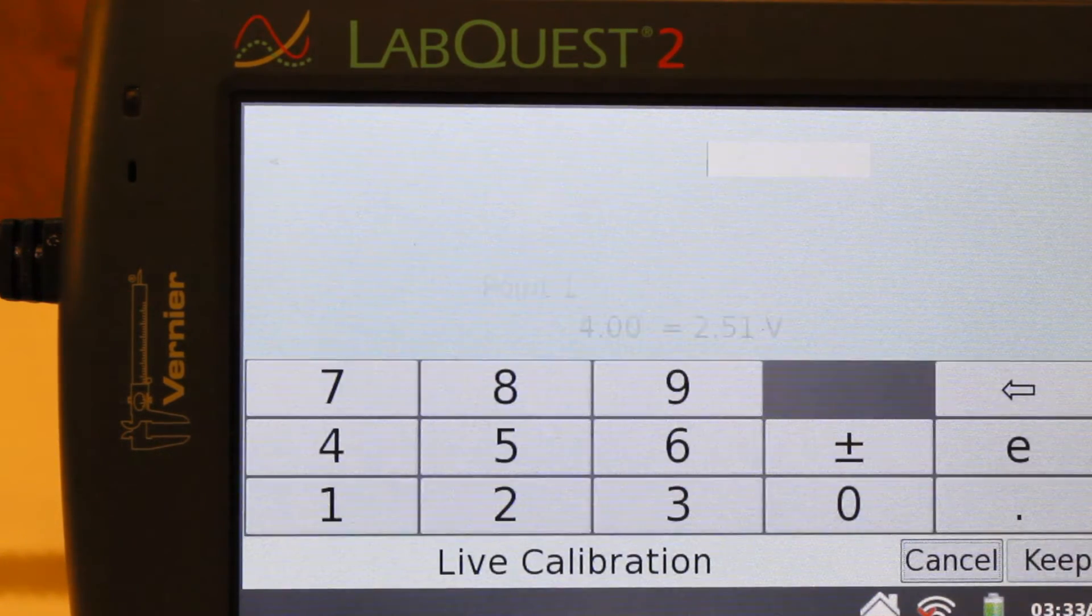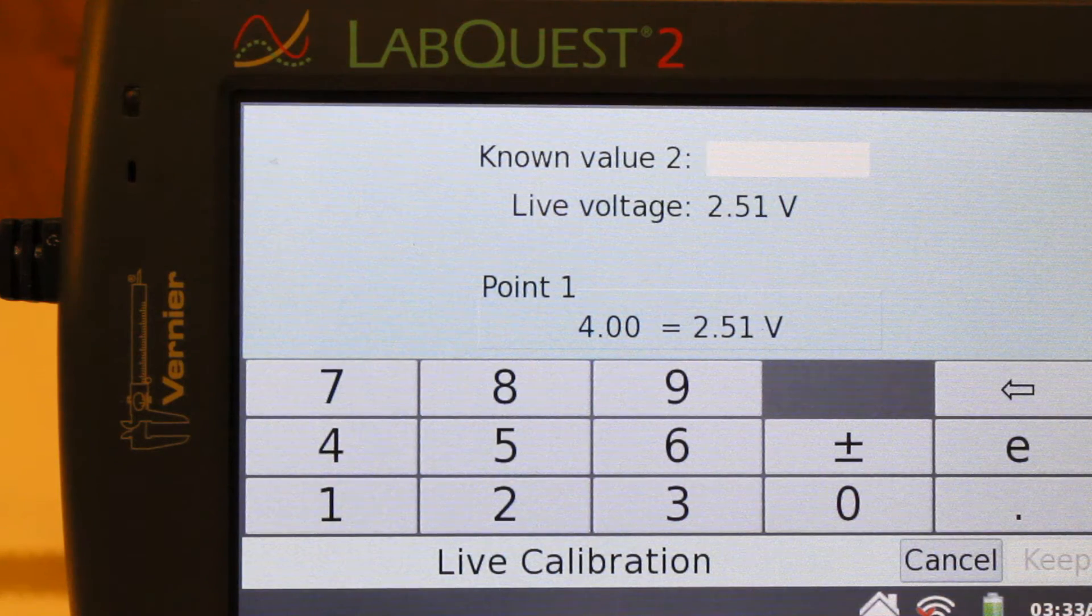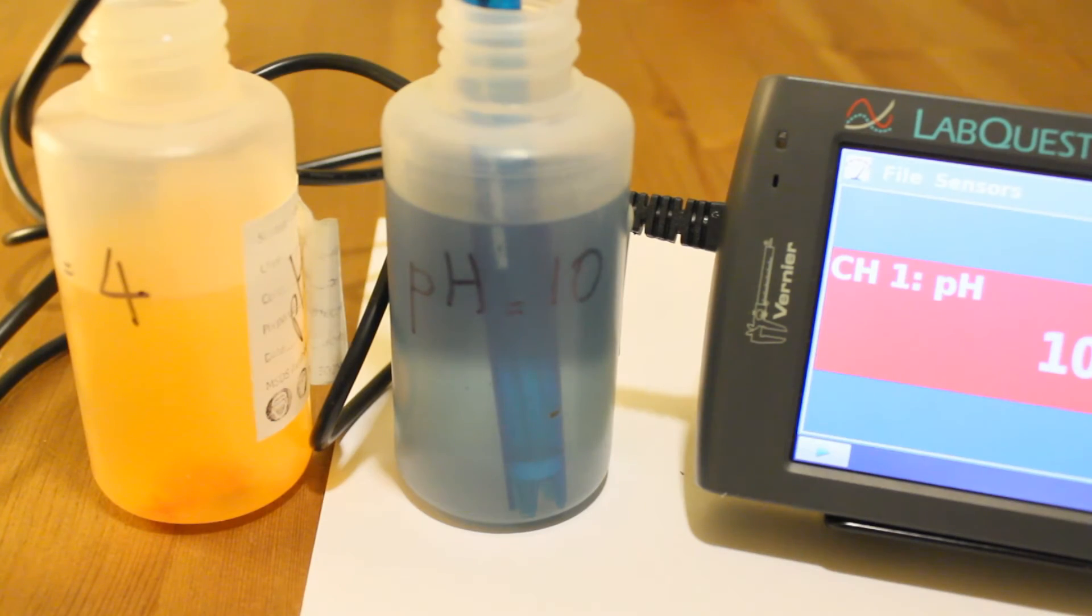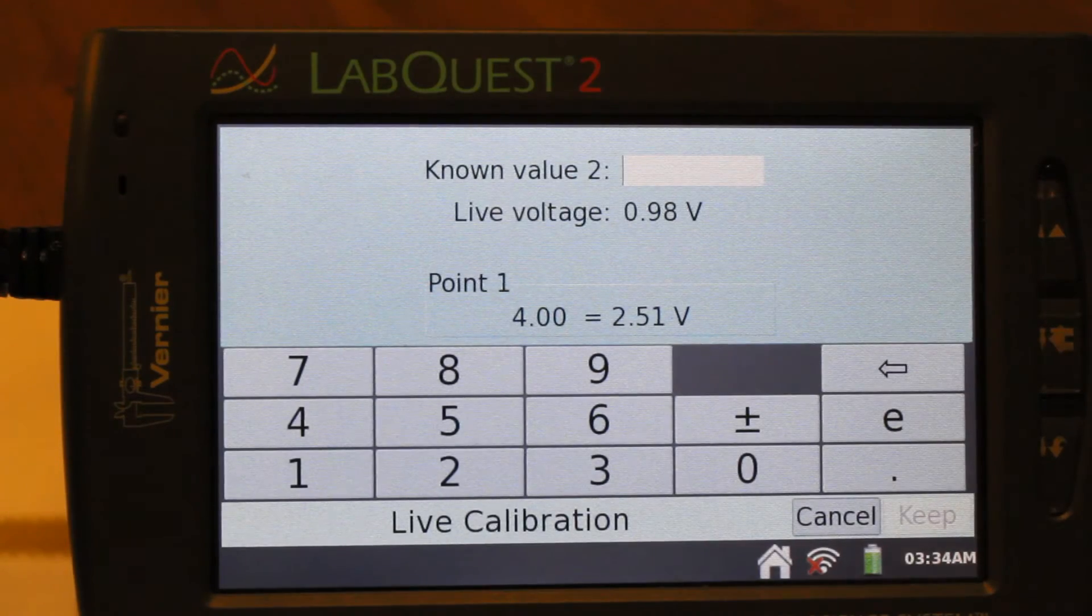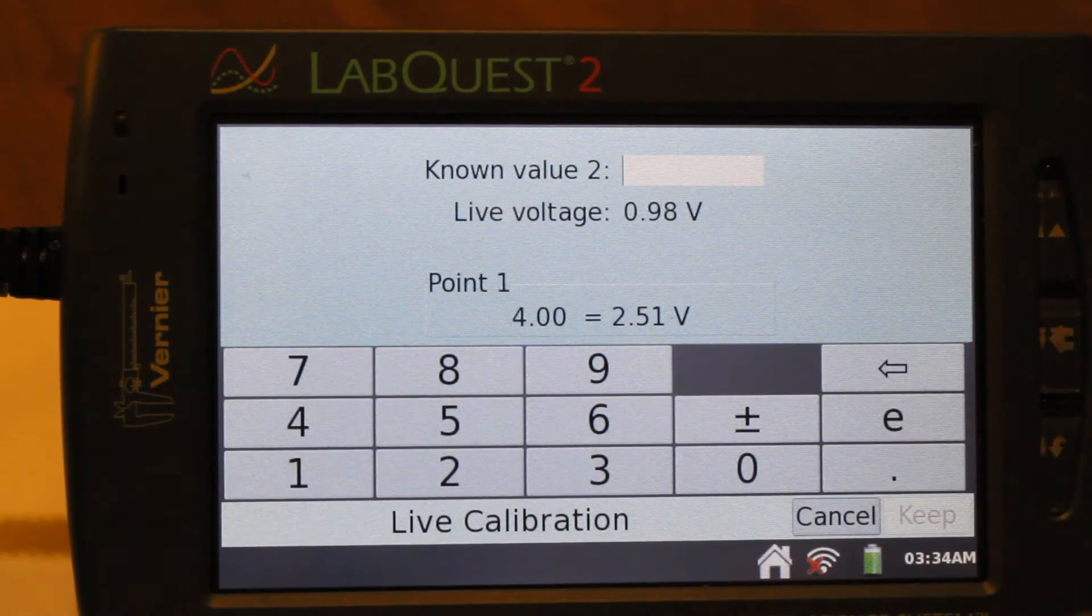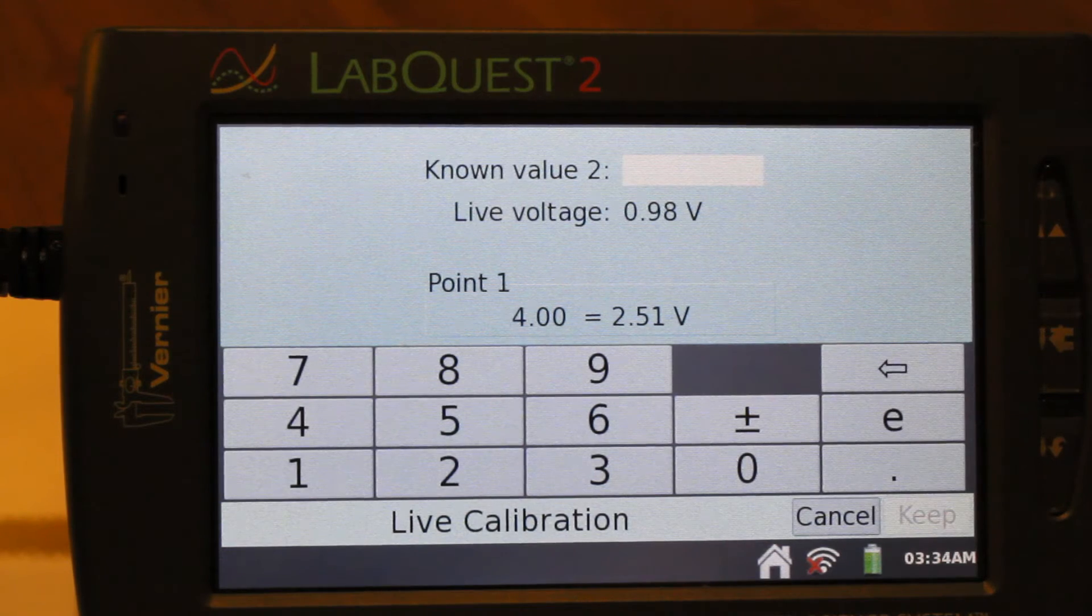After this, you should remove the pH meter from the pH 4 solution and immerse it in the buffer of pH 10. When the live voltage stabilizes, enter known value 2, in this case the value is 10.